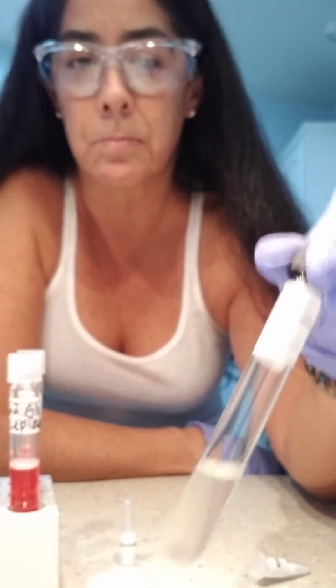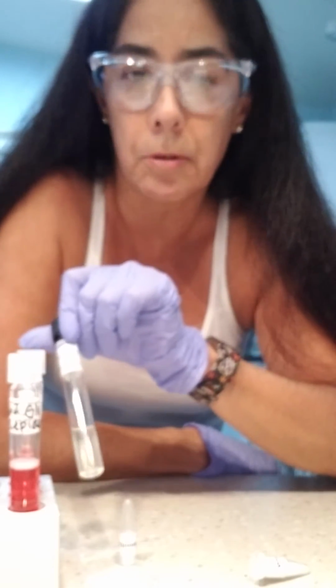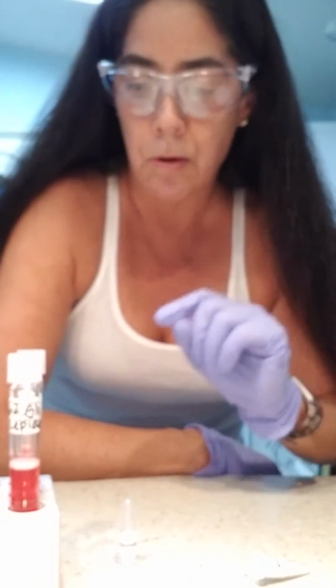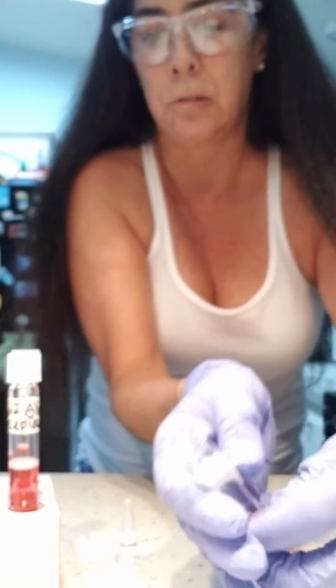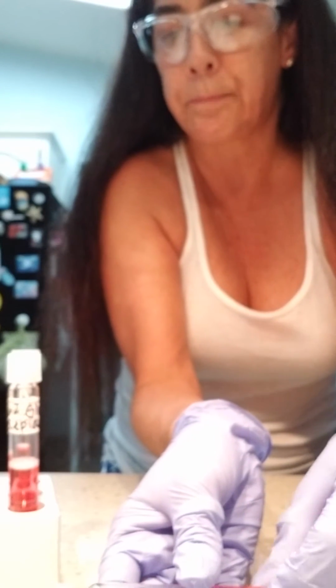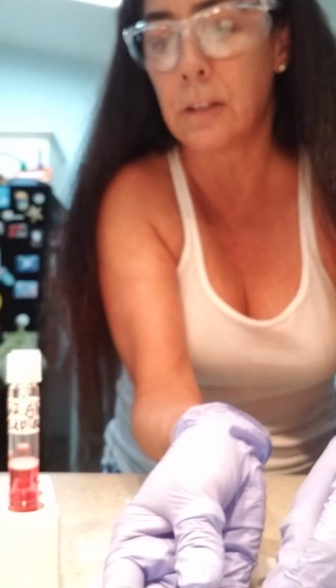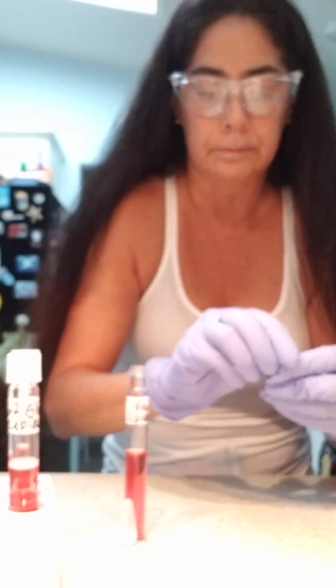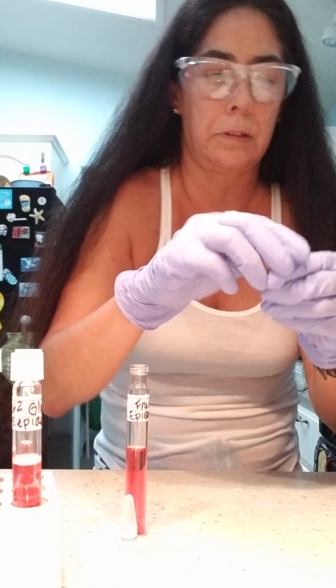And then I will also be adding 4 drops of each of these cultures into each vial with their coexisting vial names. So that's what we're going to be doing. So I've already started, and now I'm just going to sterilize my tubes. And I'm only going to be doing 1 of each, just so you can see. So basically I'll be doing 2 of these so you can get an idea of what I'm doing. So now this is the glucose.